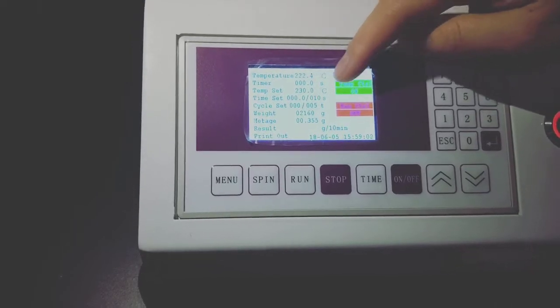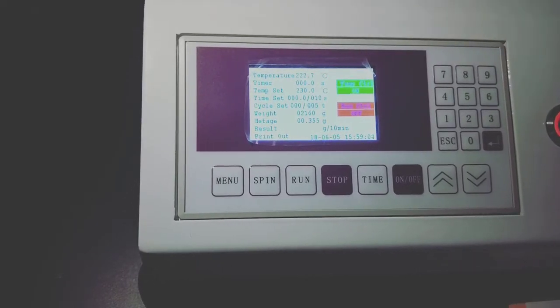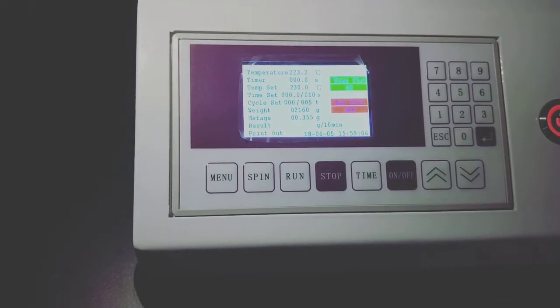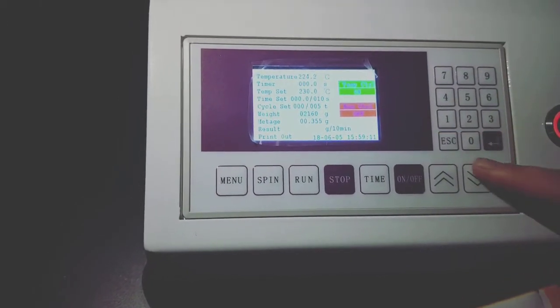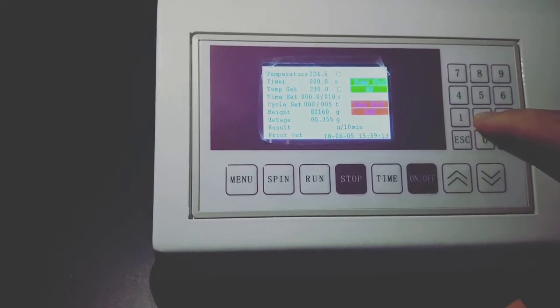And this is the cutting time set, means we can cut five pieces of extrusion sample. And the weight is 2160.